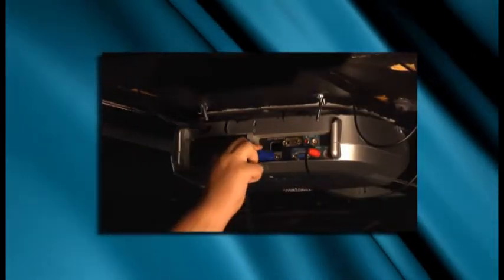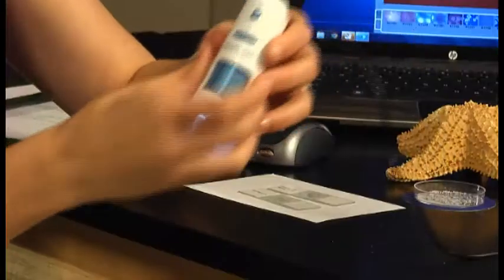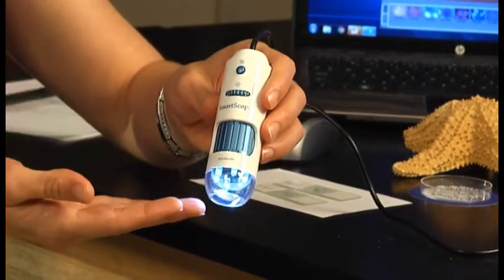You can hook the SmartScope right up to your own computer and then project the images throughout the classroom, whether that's on a screen or an interactive whiteboard. The SmartScope is extremely easy to use. As you can see, there are three controls on the front.